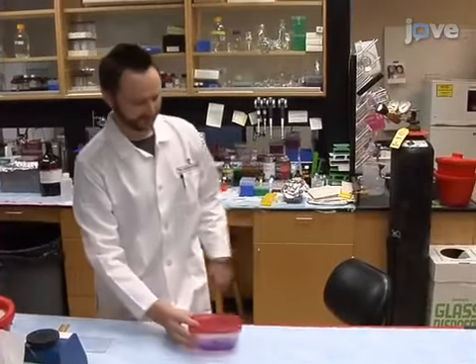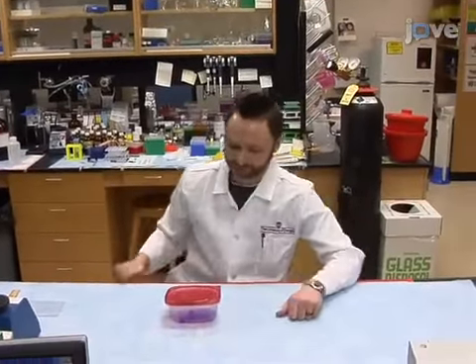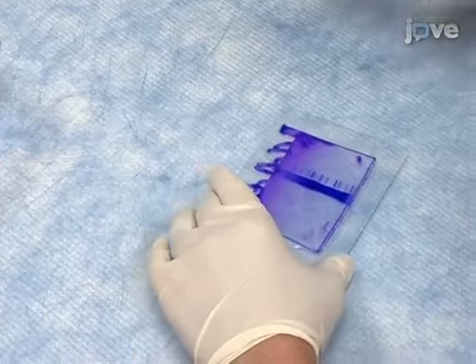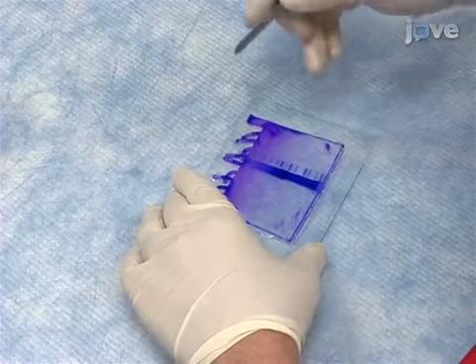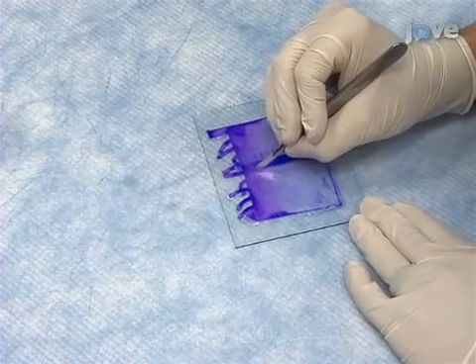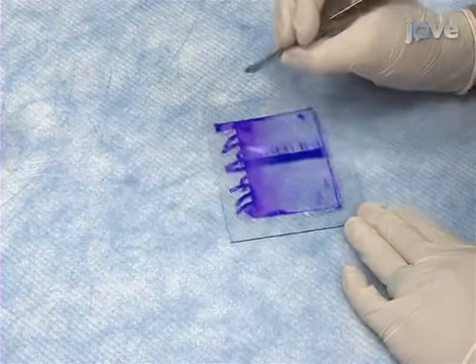Prior to starting this procedure, resolve glycoproteins using gel electrophoresis. After electrophoresis, place the gel on a glass plate and excise the region of interest using a clean scalpel.